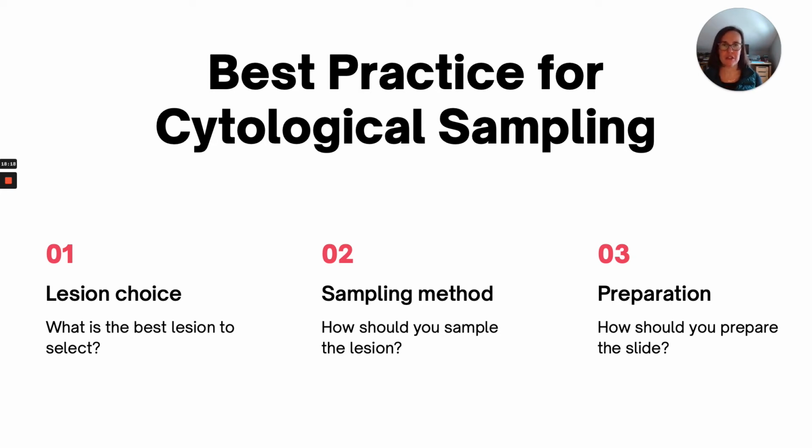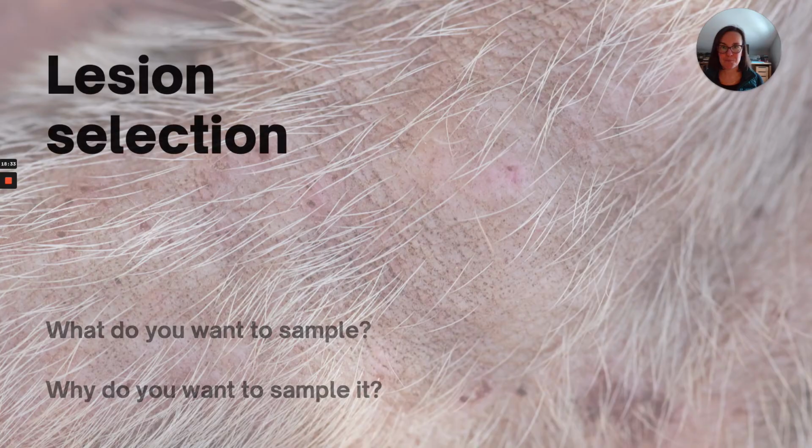So you look at your lesions globally, your patient as a whole, and then you decide, okay, which sampling methods am I going to use? And we'll talk about the three. And then how do you prepare your slide, right? Making sure that you're adequately preparing your slide so that you can actually read it is super important.